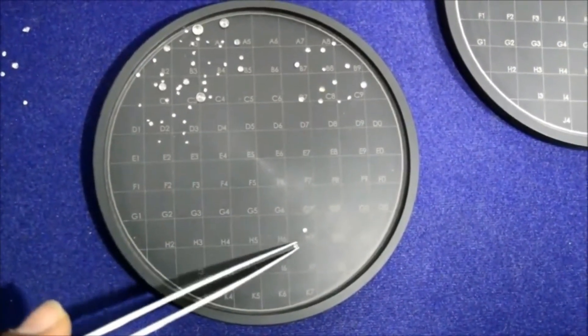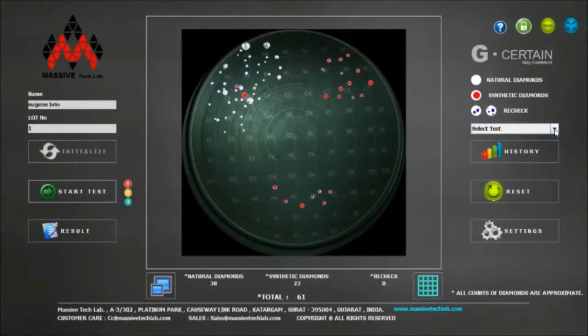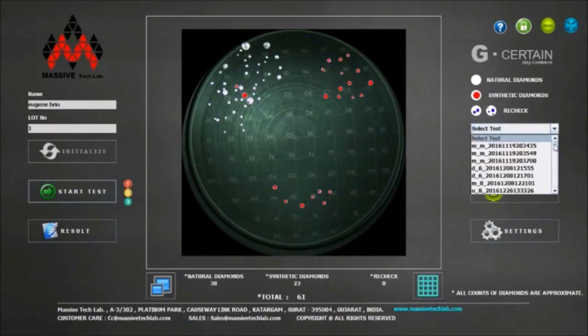For accessing result history, select test name and lot number combination from drop down menu and press history button.